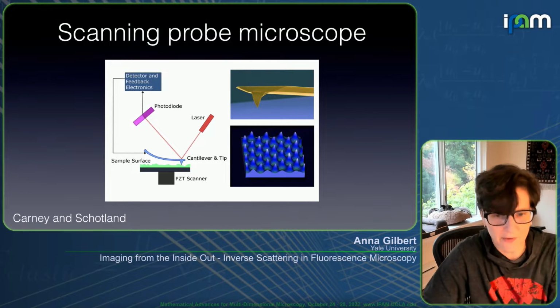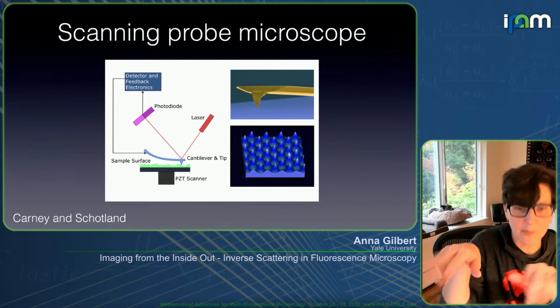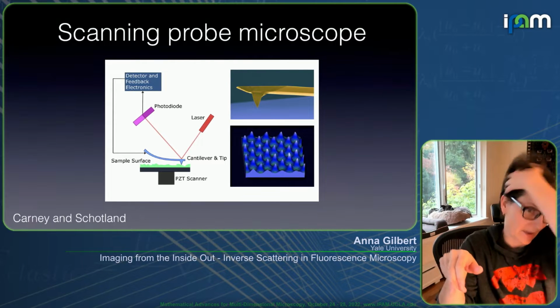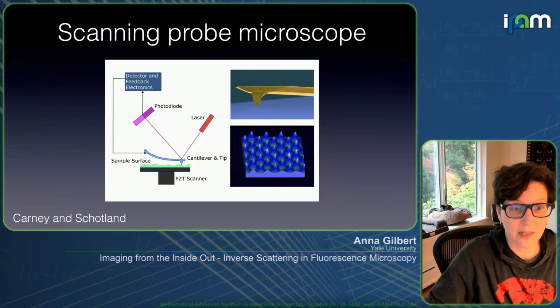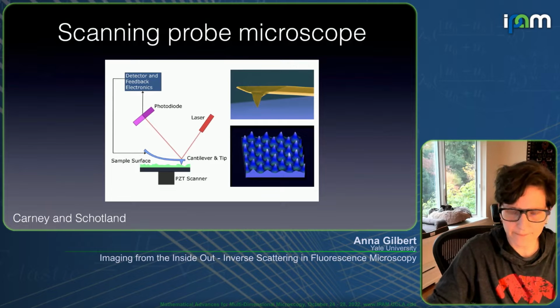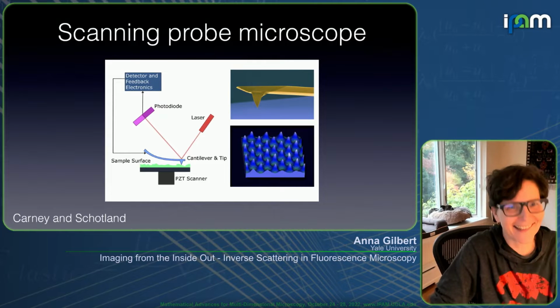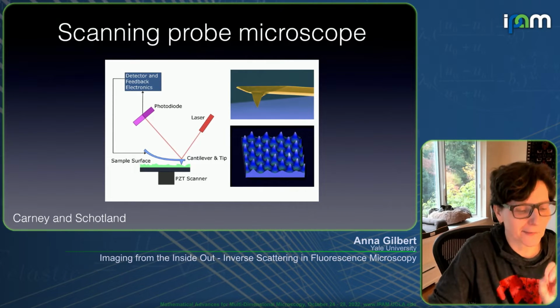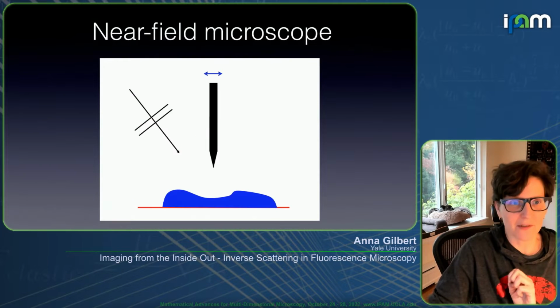You've got a sample surface and a cantilever with a little tip on it, and a laser that is measuring how much this tip goes up and down, and you get feedback and whatnot from the vibrations of this. And I do want to emphasize that I spent a while reading over some of these papers, but I am not involved in this work.